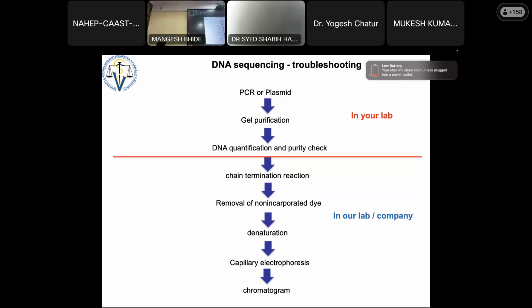Sorry? Sir, may I ask you one question? Yes, yes. Thank you very much. Sir, you said you can reuse the column for gel purification. How can we use that column? Is there any method specific for that? Yeah, there is a treatment, but unfortunately, I can send you all the protocol on how to reuse the column. There is treatment. You can use HCl or NaOH to kill the DNA. So strong acid. The problem in that is your silica is going to get fragile.